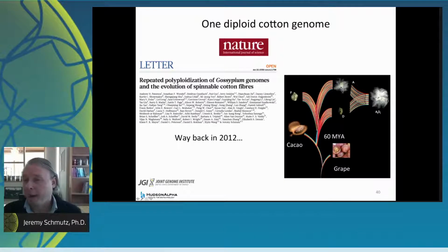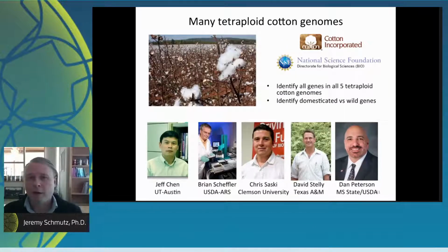And historically what happened is about 1.5 million years ago, A and D came together to form this thing that we think of as cotton in the fields, which has a lot of fiber, and that's what's planted as a crop today, called the AD genome. It's a tetraploid. It's mostly inbred tetraploid. So we started working on a many tetraploid cotton genomes project where we identified the five remaining known tetraploid cotton genomes and sequenced them all.